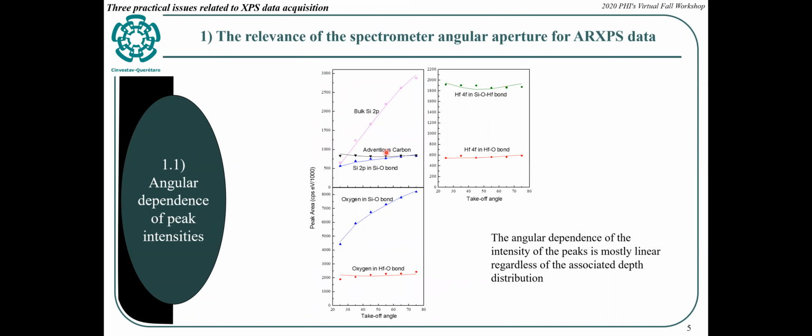This angular dependence is where we get the profile of the elements at the top surface layer.